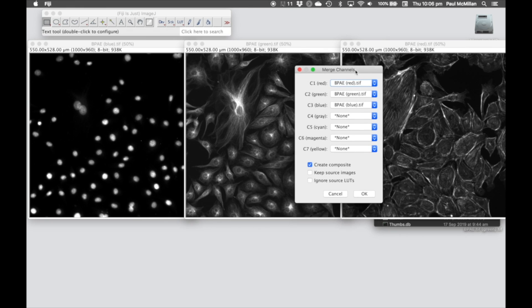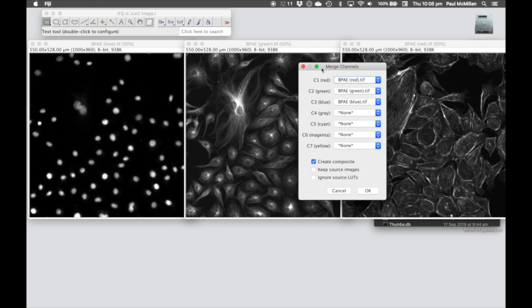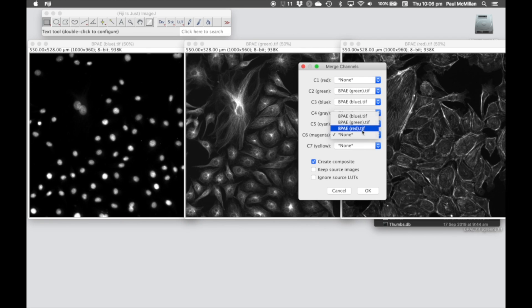Now here we've got seven of the commonly used lookup tables, so blue has been assigned to blue, green has been assigned to green, and red has been assigned to red. What if we don't want that red? If you remember from the earlier talk, we want that to be magenta, and in this case we don't want to create a composite.